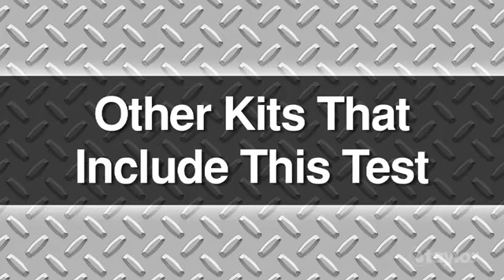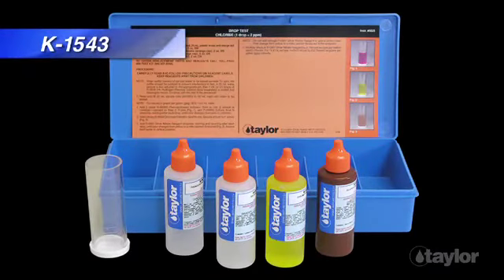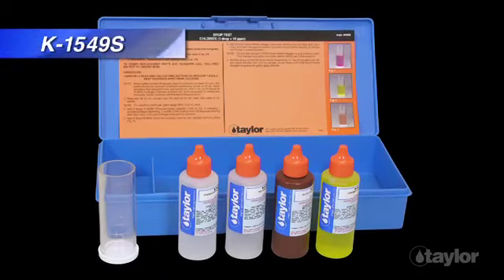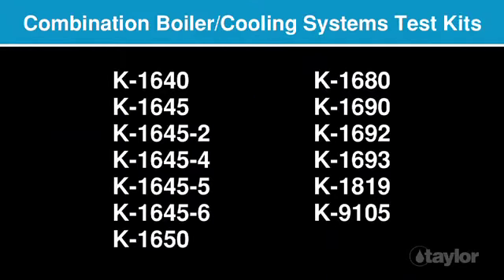In addition to the K-1598, Taylor makes several other kits for testing chloride. Combination boiler and cooling water kits that include a test for chloride are also available.